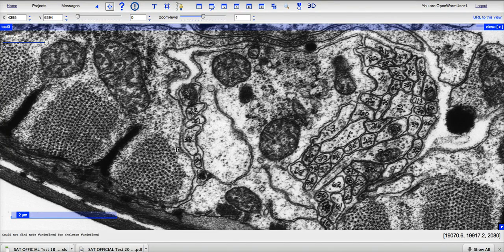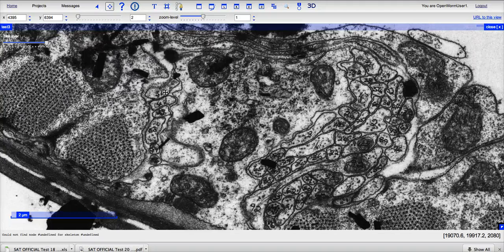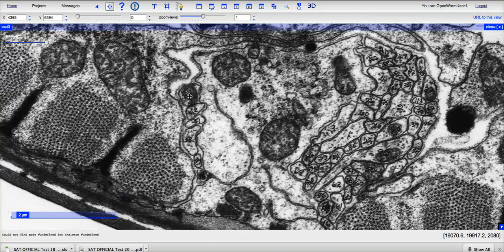So on the left we have a group of neurons, which makes up the left fascicle, and a group of neurons that makes up the right fascicle. As you can see, the neurons have a membrane around them that stains densely, and you should be able to make them out from one another. If you have any problems identifying the individual neurons, what's going to help you out is that these are scans from prints, and so these were actually annotated by pen back in the 1980s. So if you scroll through the images with your scroll wheel, you can see how every other image will have a number on it. So if you're having trouble following, it's kind of like paint by numbers, only a little bit more technically advanced.